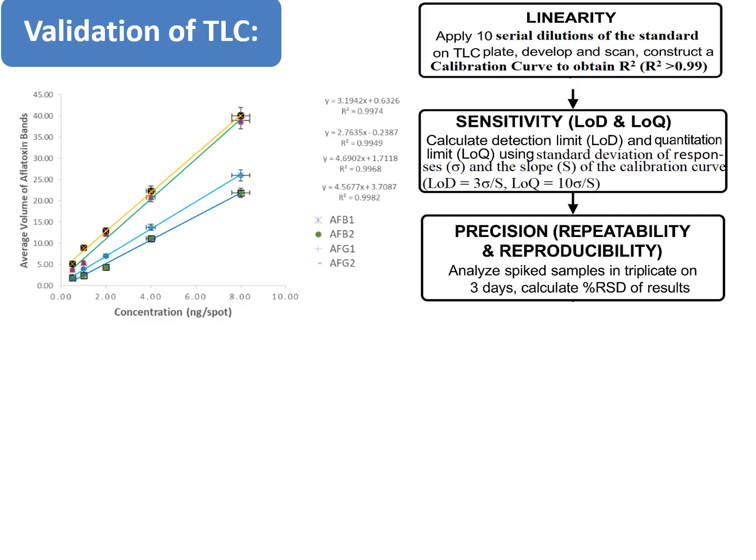In simpler terms, it indicates how consistent or reproducible the results are when the method is repeated. Precision is usually expressed as relative standard deviation, percentage relative standard deviation, or coefficient of variation of the measurement.